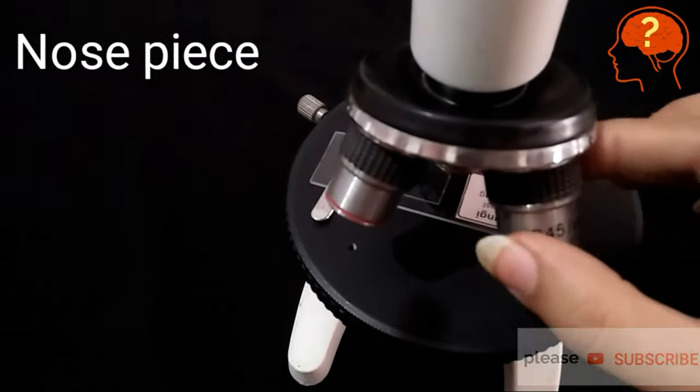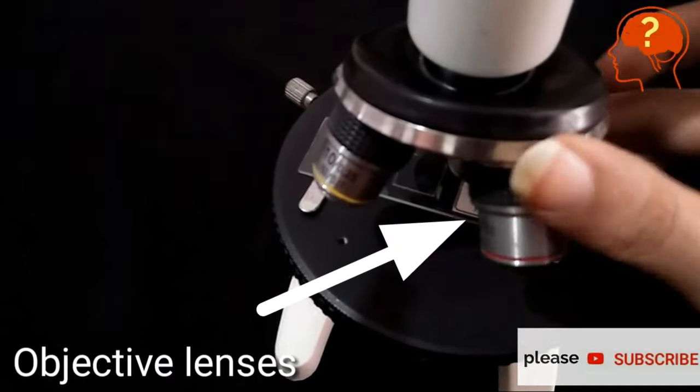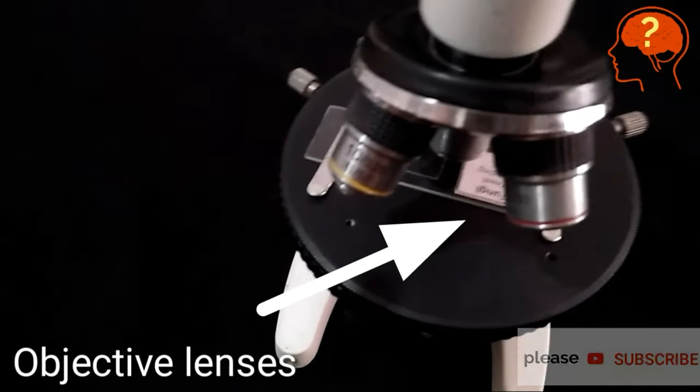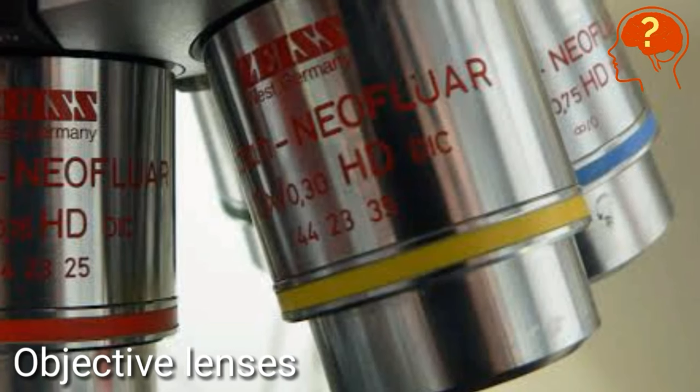This structure is called the nose piece, having three objective lenses that have color lines like red, yellow, and green. These objective lenses are the most important part of the microscope.